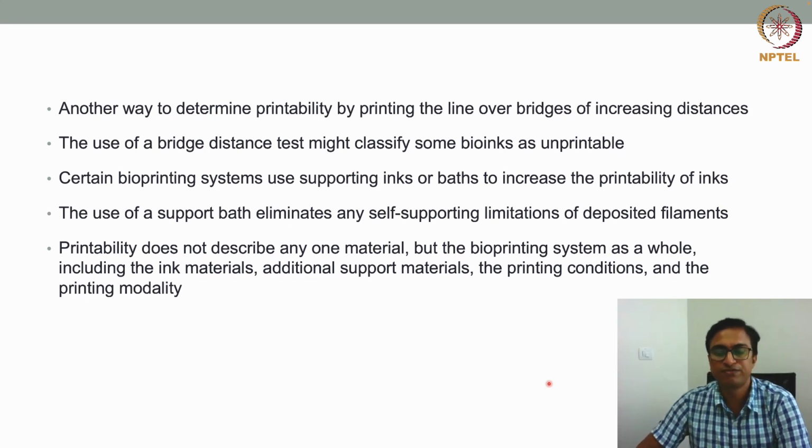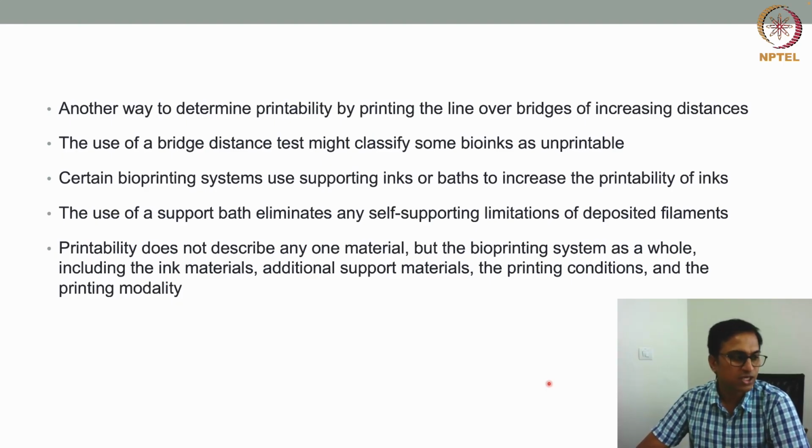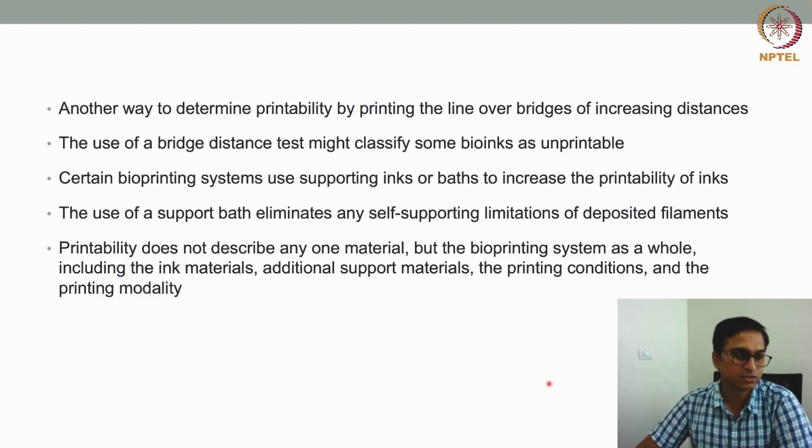Print fidelity would be very good in this case. This also means a bioink that otherwise can be classified as unprintable without a support bath, as in conventional bioprinting, can be classified as printable in a support bath.